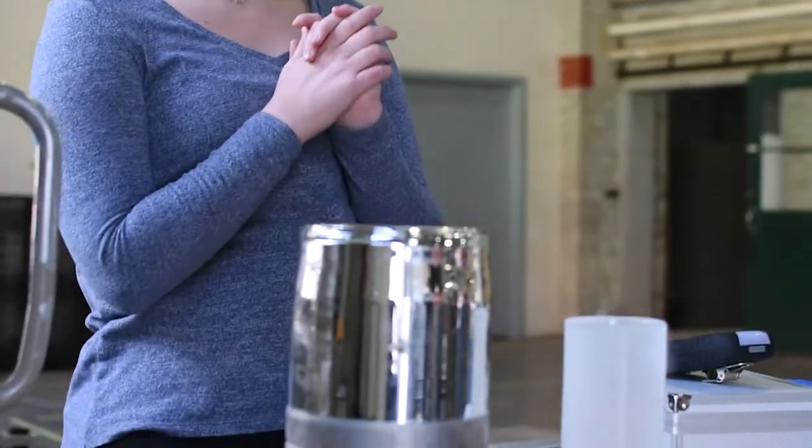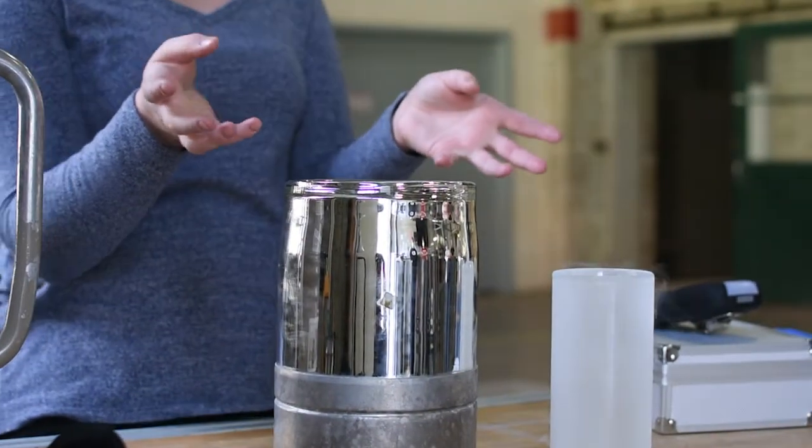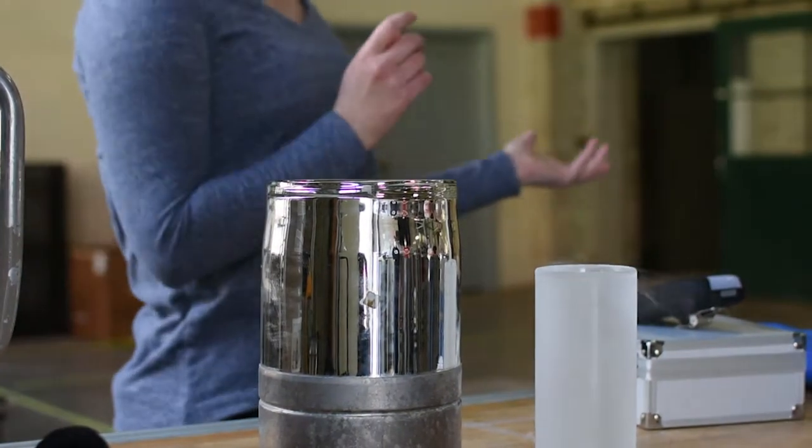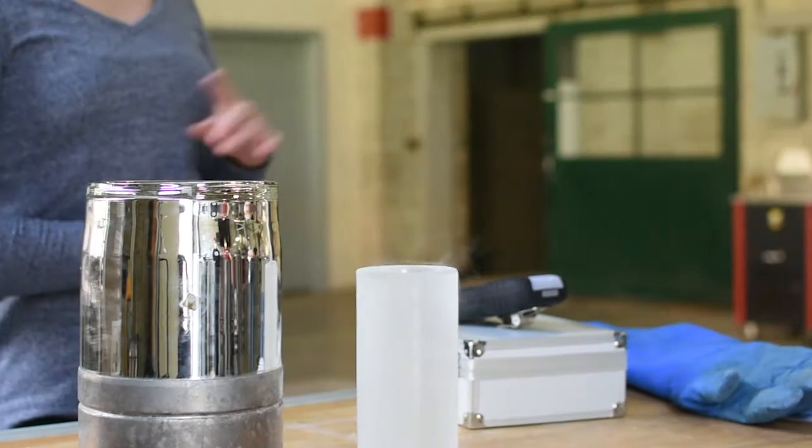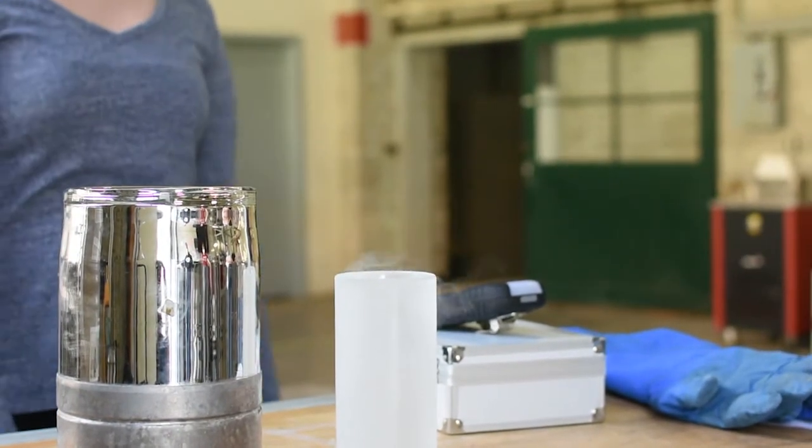The reason why it went off right here is because right above the LN2, the oxygen levels are super low. So as Greg told me earlier, if you were to put your head over this and take a deep breath, you would probably pass out, which you don't want to do. That's an example of asphyxiation, which can be very dangerous. So always make sure you use an O2 monitor and be safe.